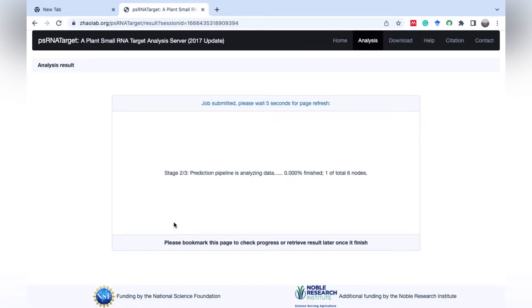Now the tool is analyzing our data to predict its target in this selected database. It will take hardly around one minute.